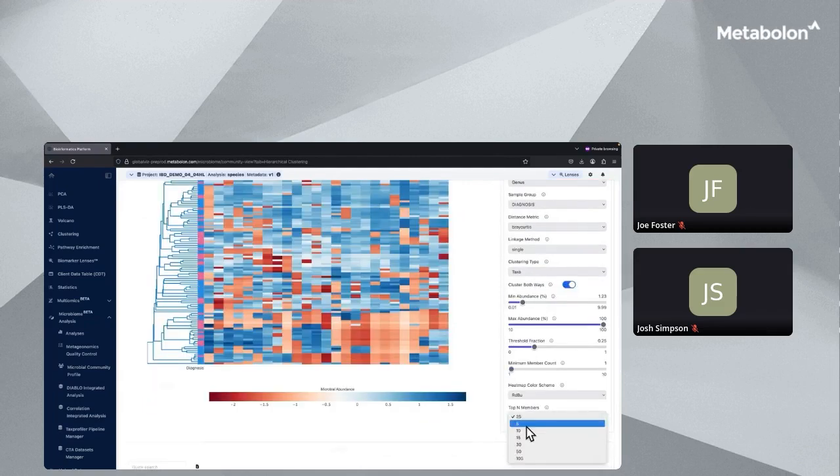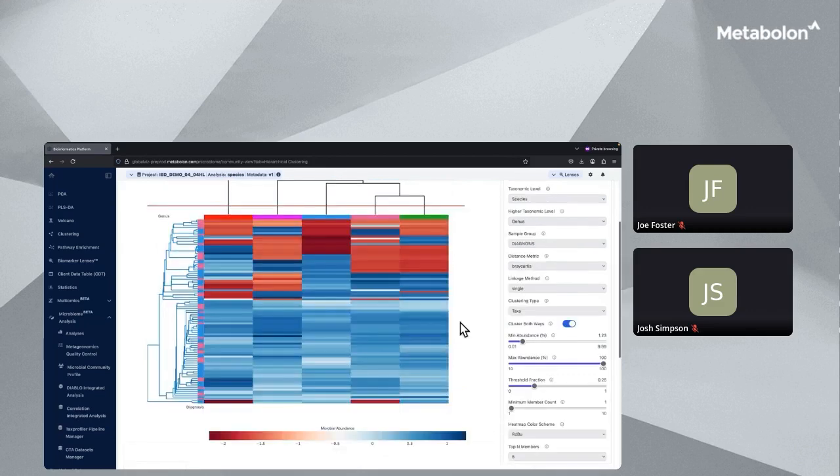For a closer look at the most abundant taxa across the cohort, I can reduce the plot to only show the top 5 most abundant species, and doing so reveals a subset of members of my cohort that have markedly low abundance of these species. Likewise, the majority of the cohort has a lot of these species, as would be expected. Generally speaking, we can use this plot to naturally group samples based on microbial profile similarity. This highlights the taxa that are consistently different in abundance between conditions or phenotypes, despite being among the most abundant taxa across the cohort overall.